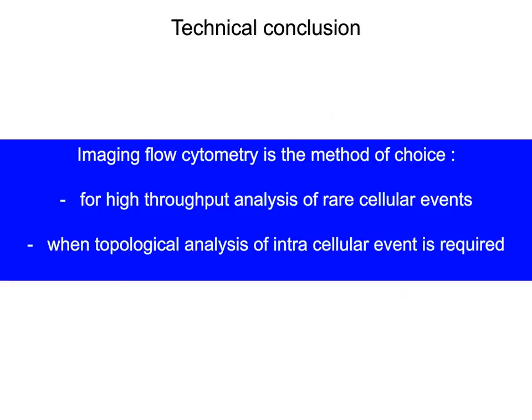Finally, I'd like to conclude on a more technical note, trying to insist on the fact that imaging flow cytometry is really the method of choice whenever you need high throughput analysis of rare cellular events or when topological analysis of intracellular events is required.